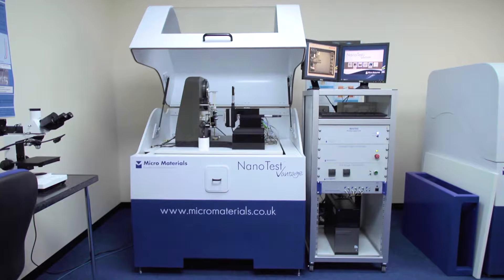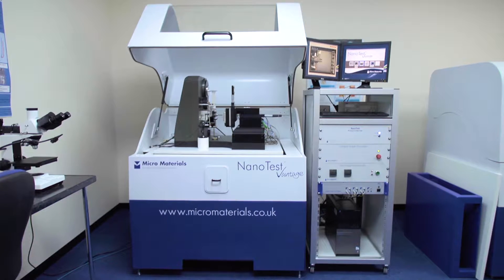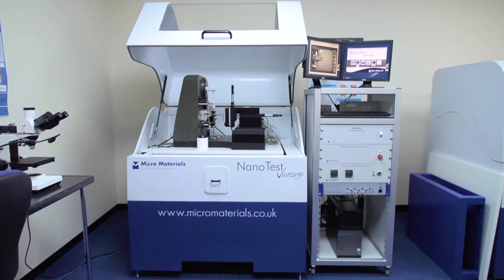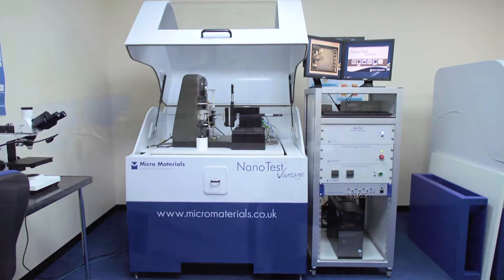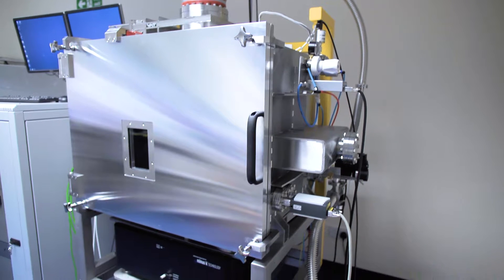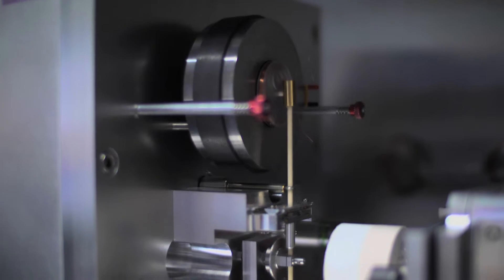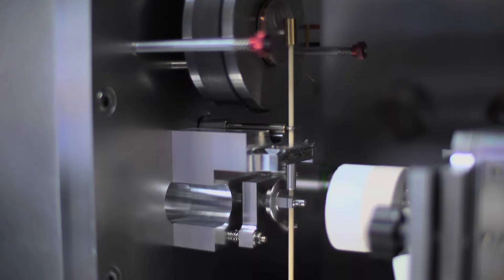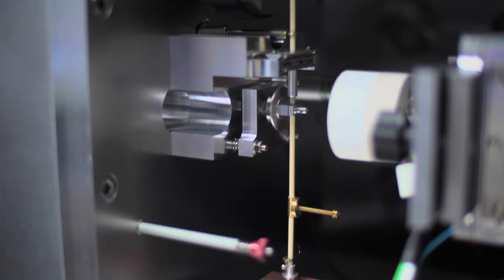With a nanotest vantage, Micromaterials already offers the most comprehensive range of nanomechanical test options. These are now extended even further with a nanotest extreme, which provides a vacuum environment testing from minus 100 to 950 degrees Celsius without oxidation or frosting of samples.